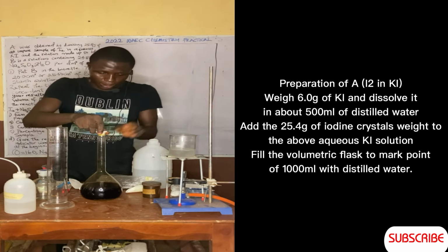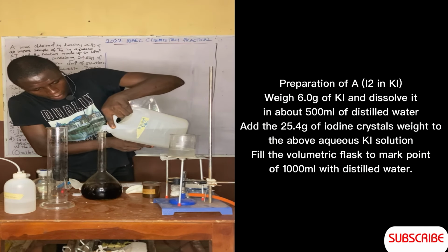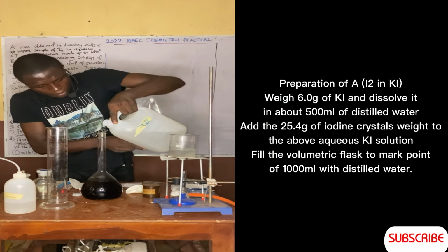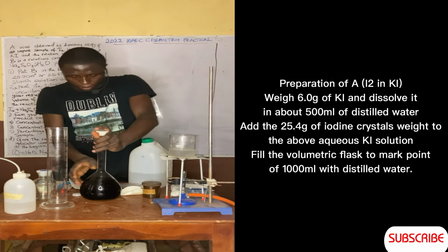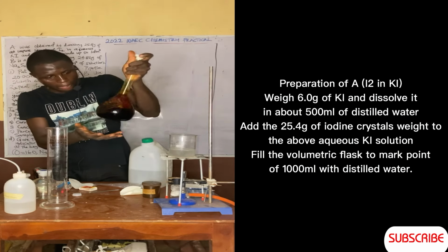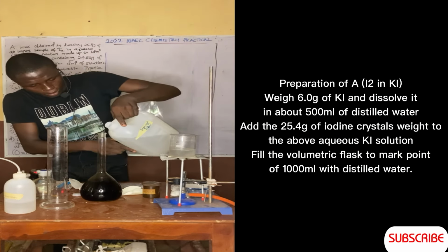So let's add the rest of the water there. Let's shake it again. Then add it to the brim now.